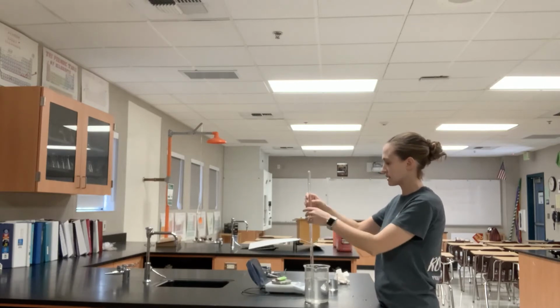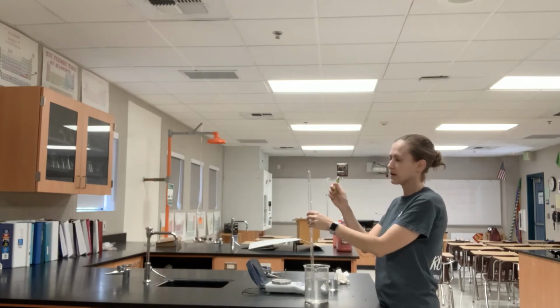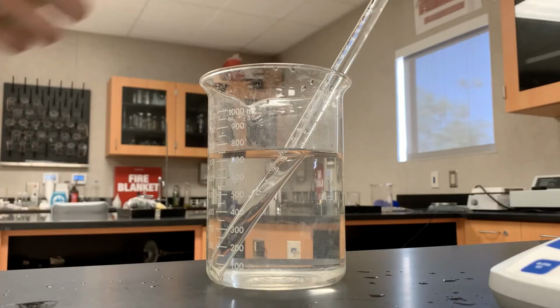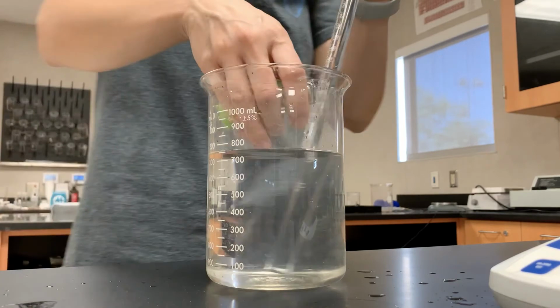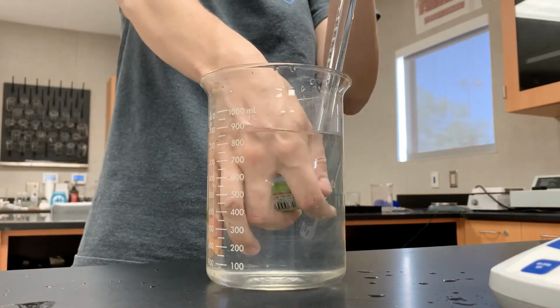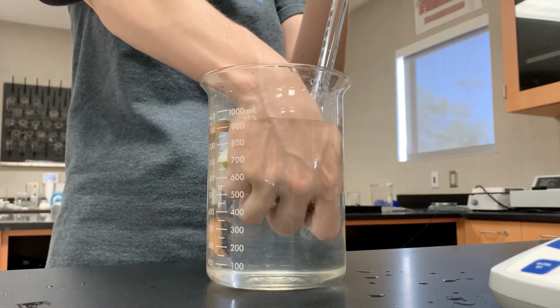My next task is to take my lighter and expel gas. I'm not going to do it right now because I want to collect all the gas that leaves it. I'm going to expel the gas by pushing this red button, and it's going to cause bubbles to form in the eudiometer. So let's see that. All right, I'm going to put the lighter under the very bottom of the eudiometer to the best of my ability, making sure the eudiometer stays underwater. And now I'm going to hit the button.